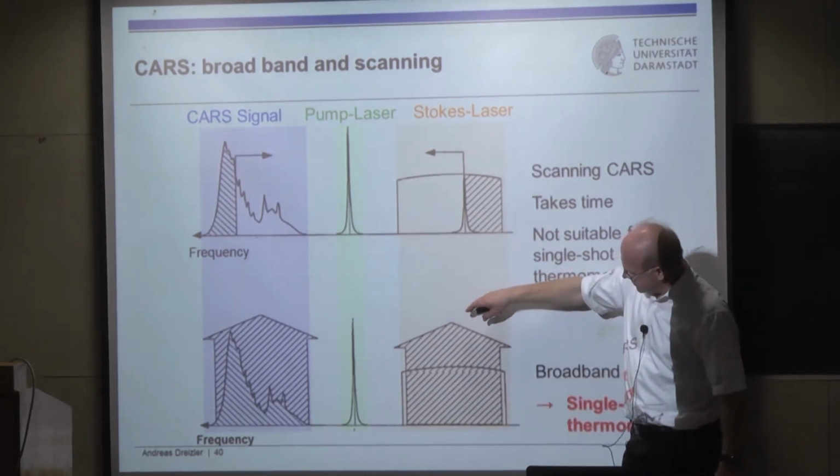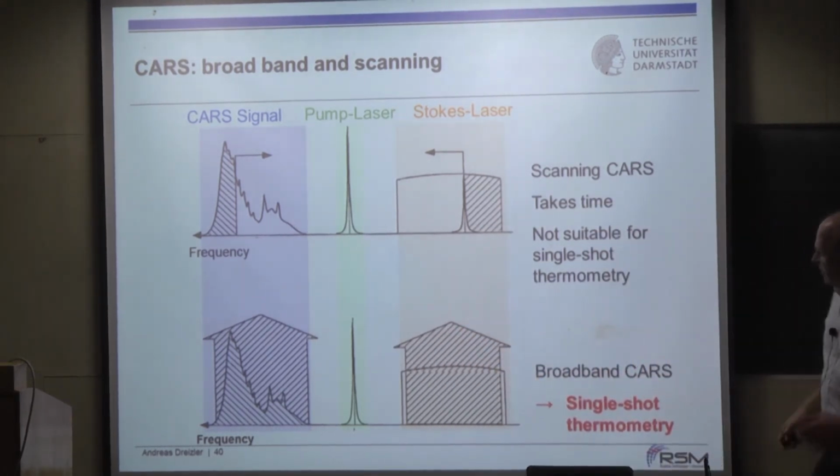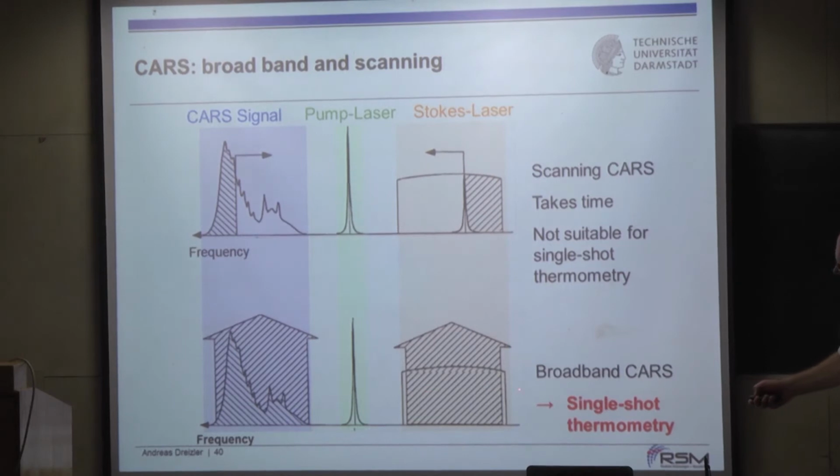In turbulent combustion, you have a broadband dye laser. A broadband dye laser gives all the frequencies simultaneously that you obtain here time after time. And so these Raman coherences between the pump and the omega-2 photon give rise now to an instantaneous spectrum.